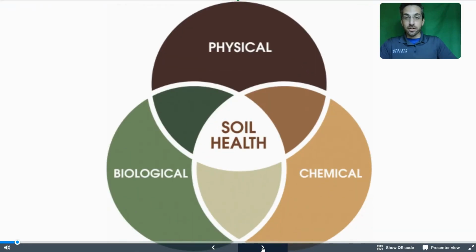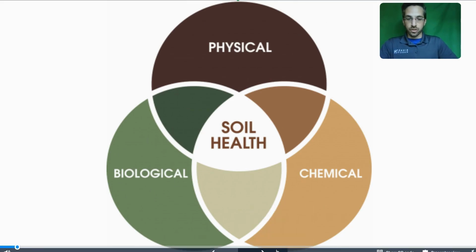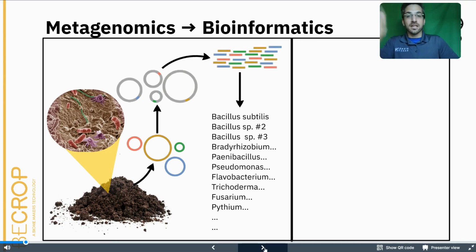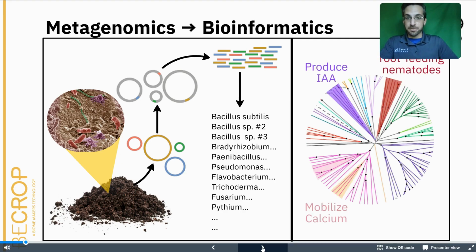As a quick reminder, this is an analysis of the biological component of the soil. We can't see nutrients themselves with this test, we can't see pH, can't see texture. We're purely looking at the living fraction in soil, the organisms. We've extracted the DNA from the bacteria and the fungi in the soil. We've snipped out just the piece of that DNA we need to identify who it came from. That gives us a very comprehensive view of who's living in your soil, and from there, this report will express to you, here's your soil's capacity to perform various agronomically relevant functions.